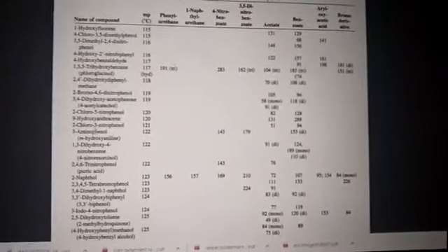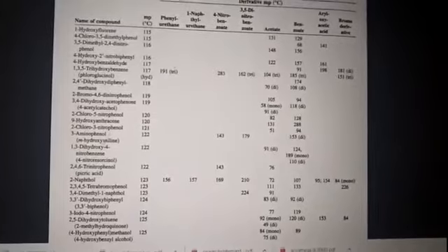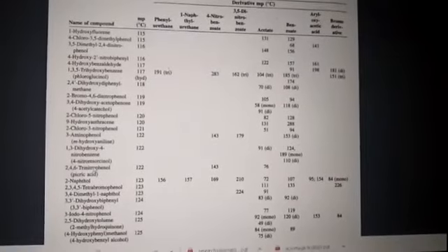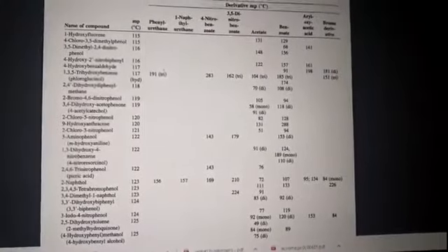I can tell you that none of you have any nitro compounds, so you can cross out any of the nitro compounds. Aside from that, you have to use what you've learned so far from your spectra.